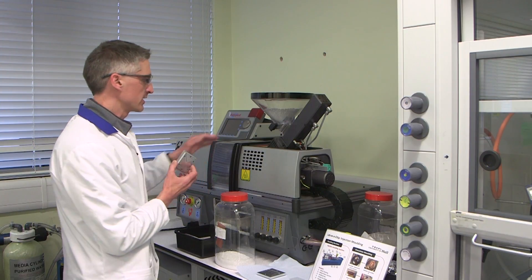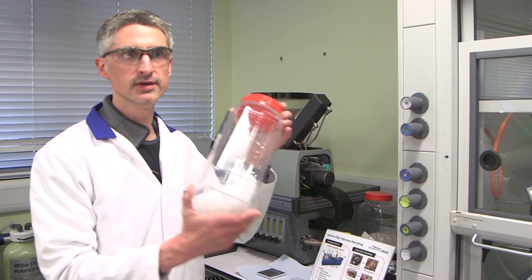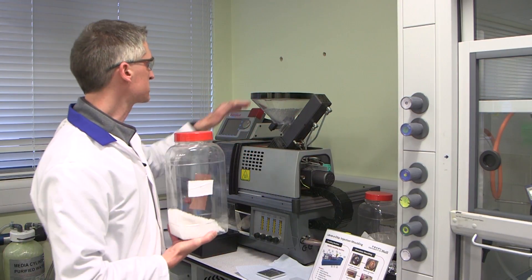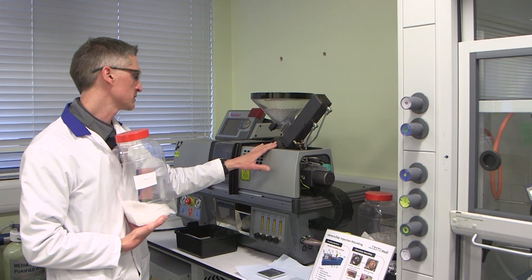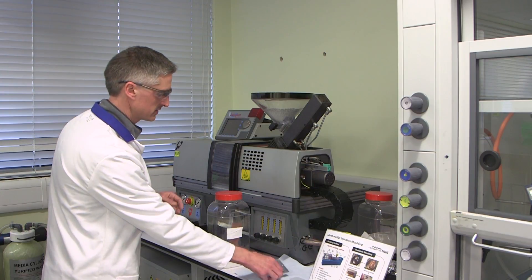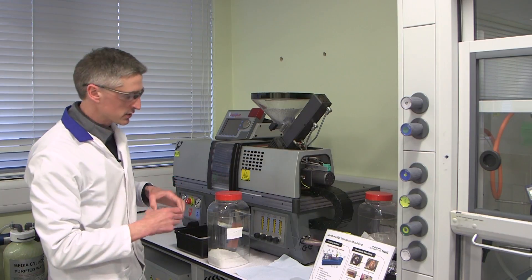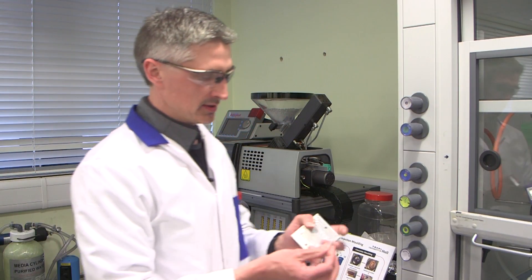This is then placed into our injection moulding machine and instead of chocolate we use polymer beads like this. These beads go into the hopper here, they're heated up to the melting point inside the injection moulder and then under pressure they're forced into the mould, and then they cool down to form a thin wafer with our microstructure.